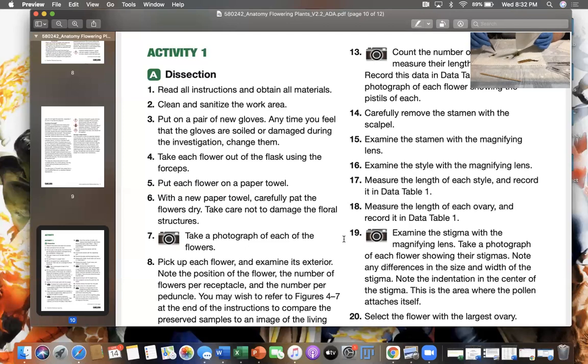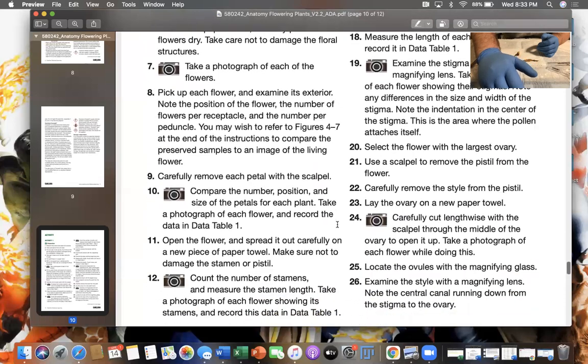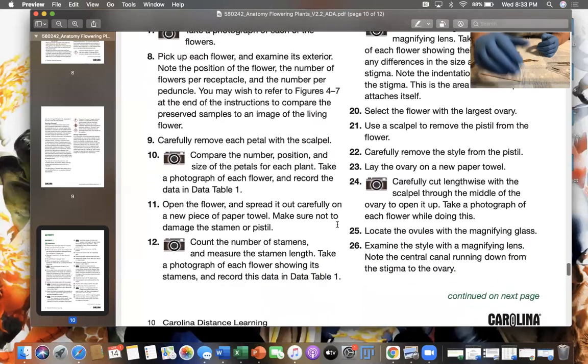I'm just going to use... I have no idea what's going on with this plant. My box is kind of my trash can here. Okay. So using a clean hand. So at this point, take pictures of what you need.